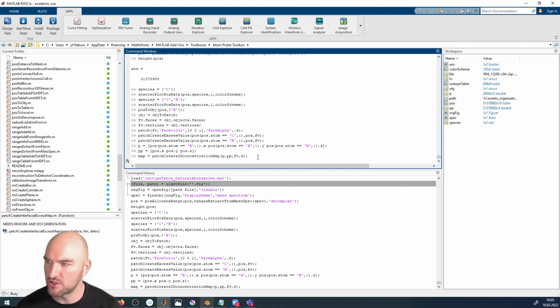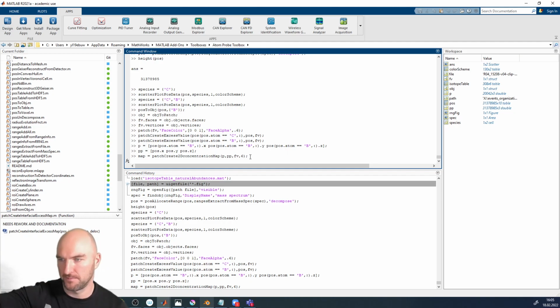So one question in the chat was about sorting. What I mean by sorting is sorting the atoms according to the distance to the interface. Which we don't really need to do when we, for example, create a proxygram, because with a proxygram we only need to say, okay, if you're closer than this or further than this, you're in that bin, and so we'll take you into account.